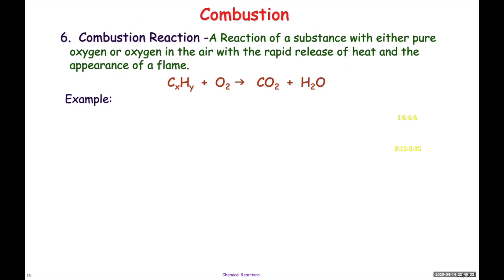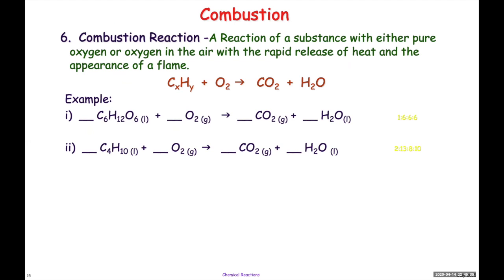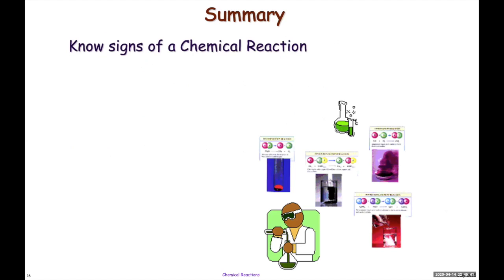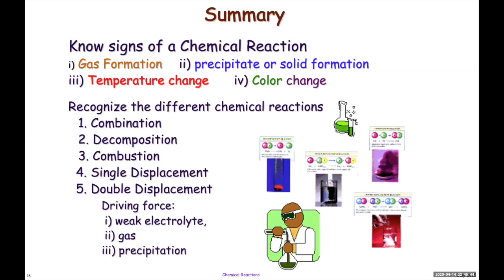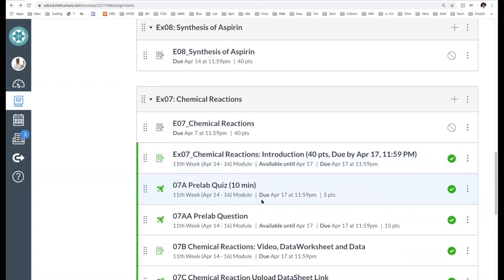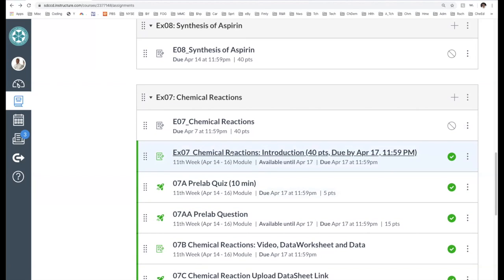So the last reaction that you have is a combustion reaction, and that's just heating something in the presence of oxygen and watching it burn. So this is basically the PowerPoint I would have presented in a lab so that it would prepare you for the experiment coming up. In chemical reactions, this is where you'd find the PowerPoint.